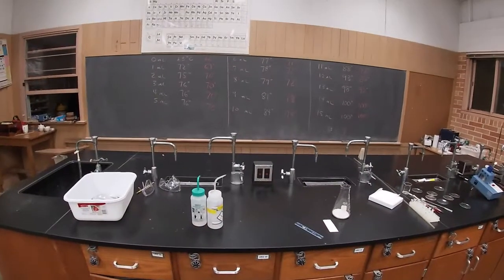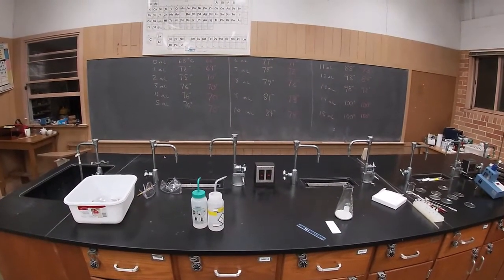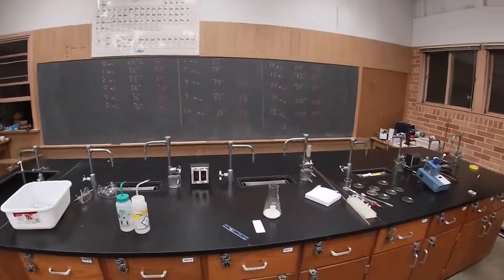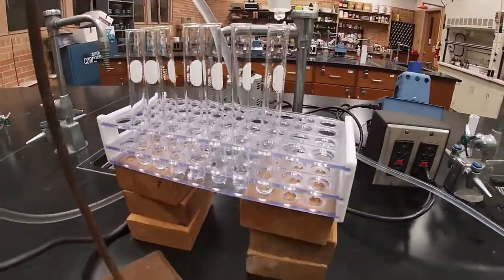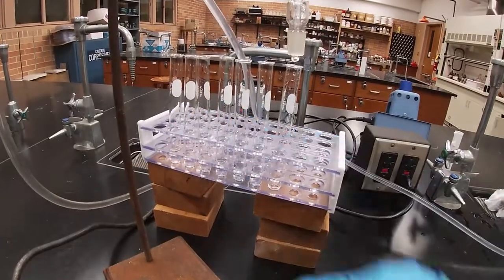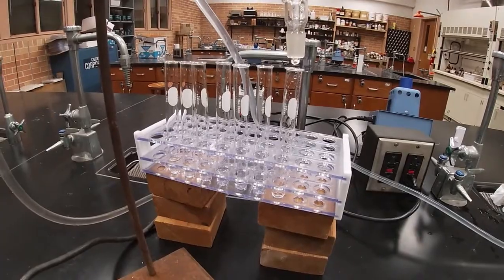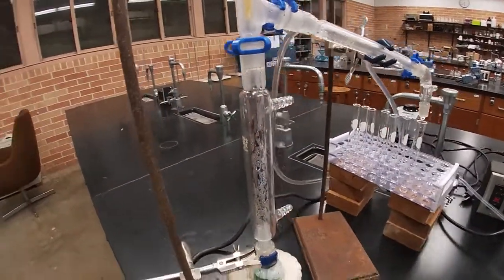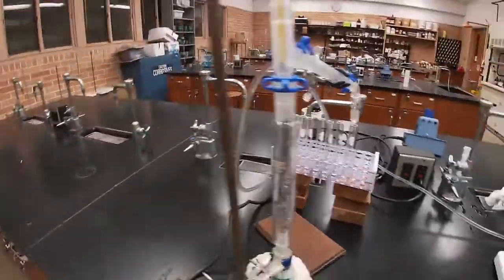If I were to look at that data, I would collect like the first 10 mils and collect that together. I probably wouldn't collect mil 11, 12, and 13, okay? But nothing's coming over right now but water. All right, so I would collect the first few fractions and put them together, and they would be essentially pure methanol. I didn't get the best separation. Maybe could have a little bit better of a column here. But I'm going to go ahead and shut this down.